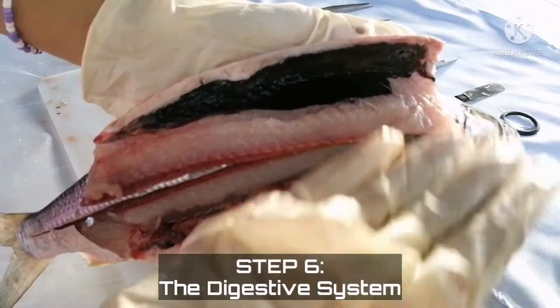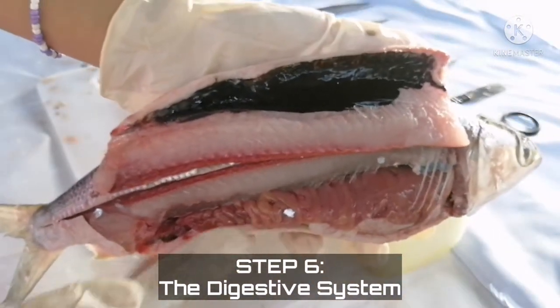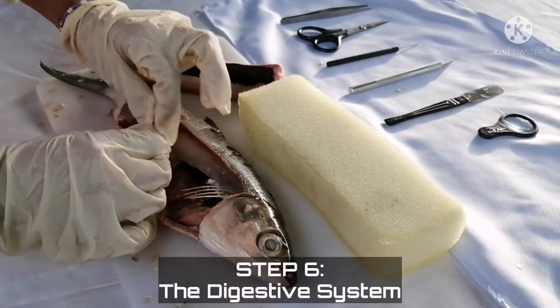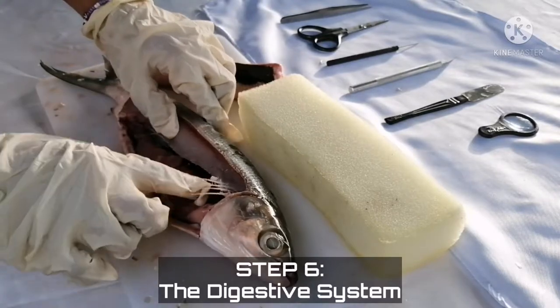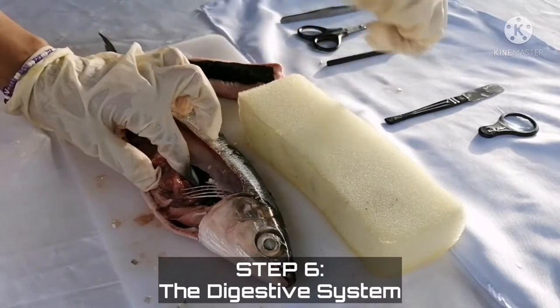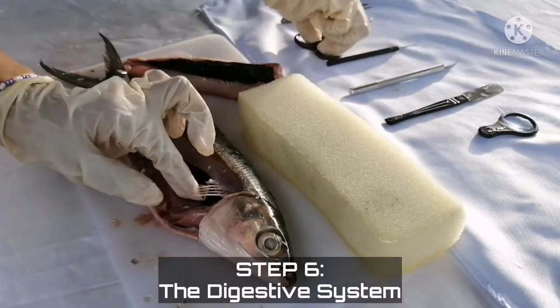So this is the digestive system of the milkfish. The next step is to remove the digestive system of the milkfish that includes its liver, intestines, and stomach.